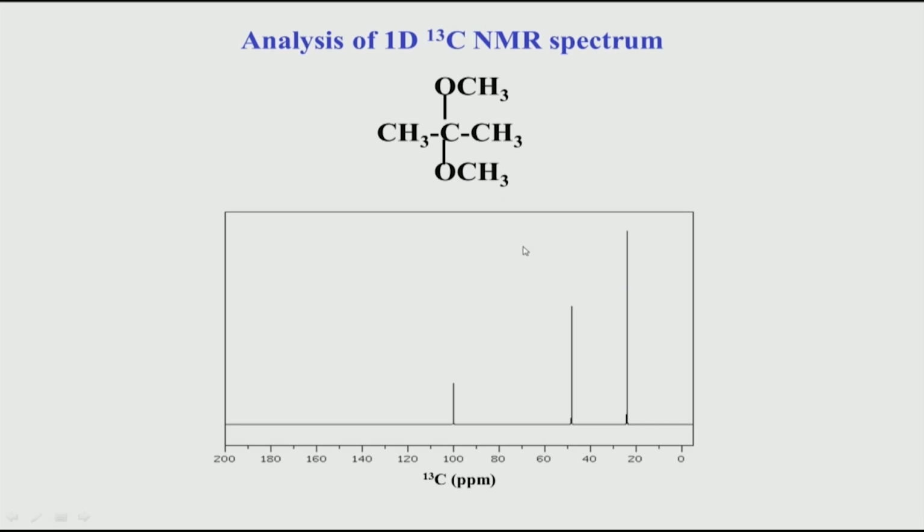Similar to what we saw in the proton, by looking at each bunch of peaks, which we call a multiplet structure, we can find out the number of types of hydrogens or protons. Similarly, here by counting the number of peaks, we can find out how many types of carbon there are, but we will see this rule does not always hold true, because sometimes some peaks are missing, and sometimes the OH peaks are broad. Similarly, in carbon we will look at aromatic cases, where it is sometimes not easy to count the number of peaks, but roughly you can estimate the number of carbons simply by looking at the number of peaks.